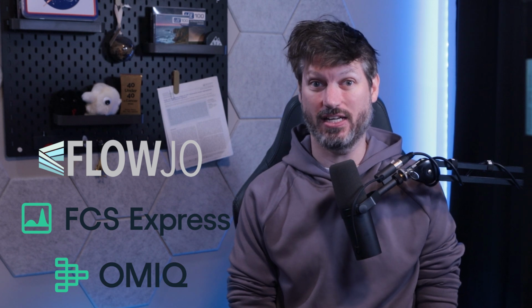So you did it, quick and easy. Now you can progress either in R or your favorite other analysis software with the cleaned FCS files.